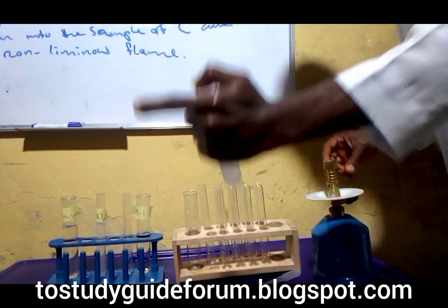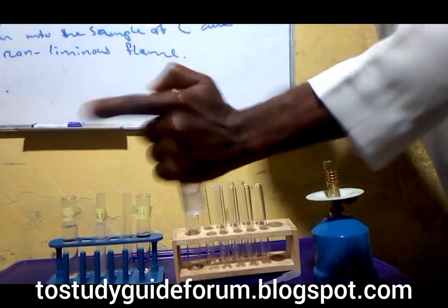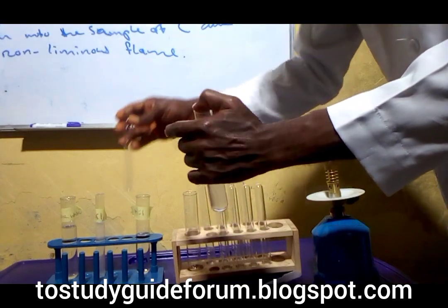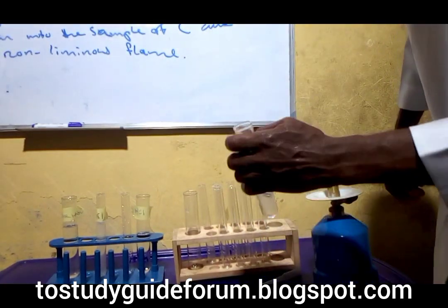We're shaking it. It seems soluble. Let's shake very well and add more water to it. Okay, you can see now we have a clear solution. That means it's very soluble.